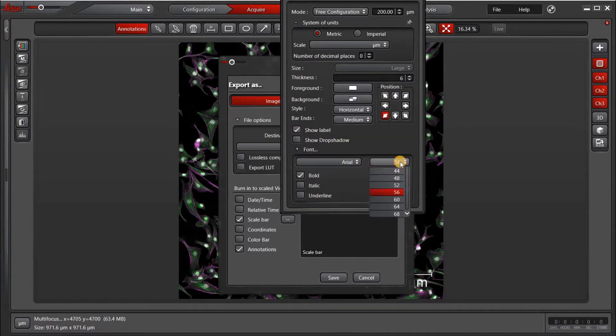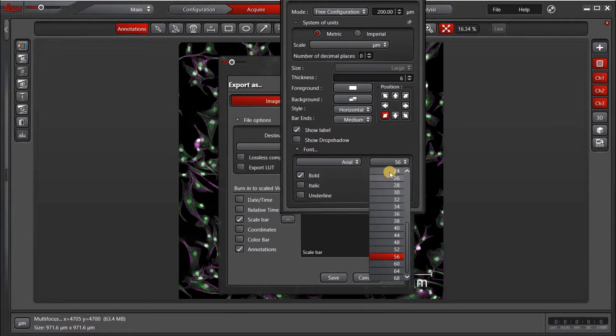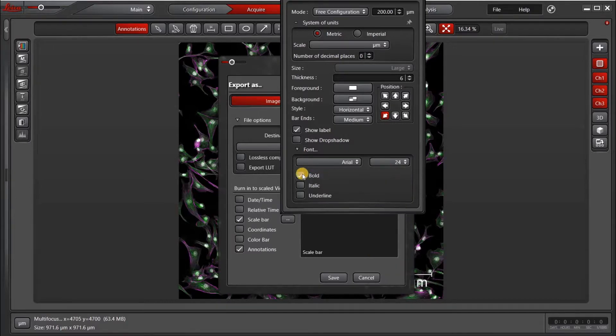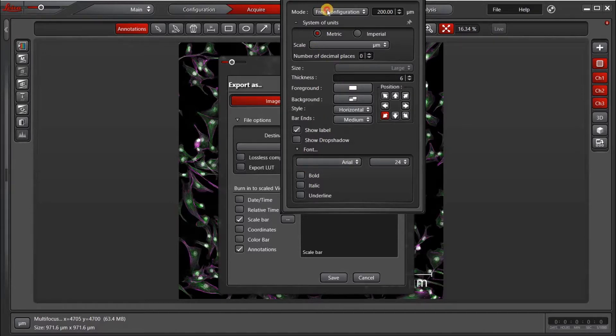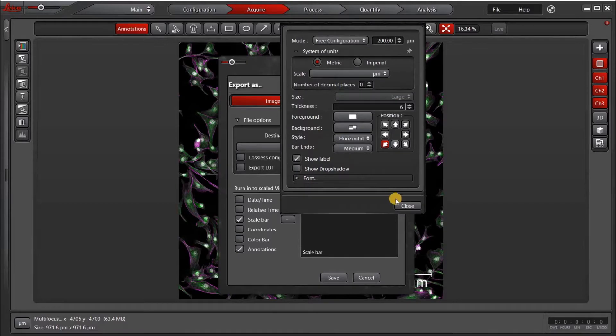In terms of font, I will also choose 24 so that we can have the same size on both, and you can see the difference between them. And when we're done, go ahead and click Close.